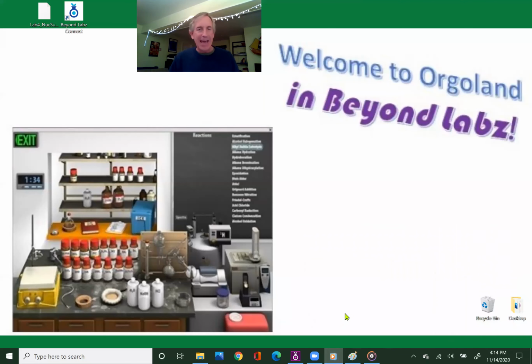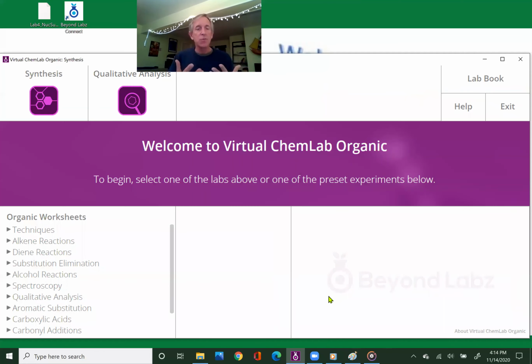Okay. So let's begin with the assumption that you have already downloaded Beyond Labs and you have Beyond Labs Connect as well. You will need those to open up the following platform. This is what you want on your laptop or computer: you want to be able to access this page, the Virtual Chem Lab organic page. So don't go into the physics page or any of the others that Beyond Labs has. You want the organic one.